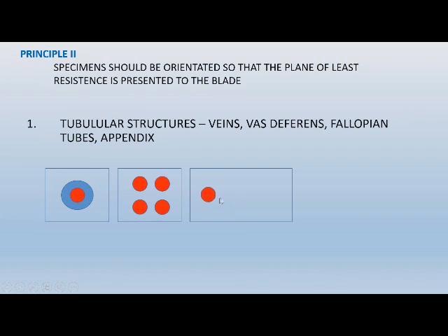So what if we embed it like this? That way, we've separated it, but the problem is we probably have a bigger block, and as we go through this, we're going to increase the resistance by 4 times instead of 2 times here. So how about if we try embedding it diagonally? This way, every time the blade goes through one, it is barely getting a second, it's kind of like 1.5 times.